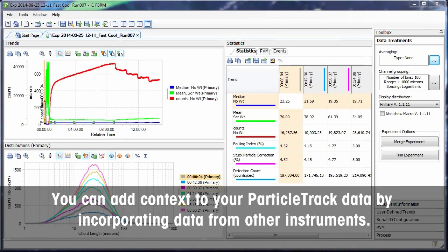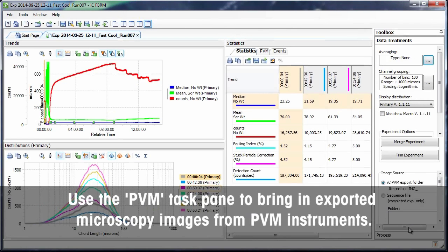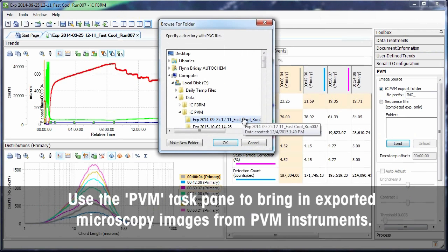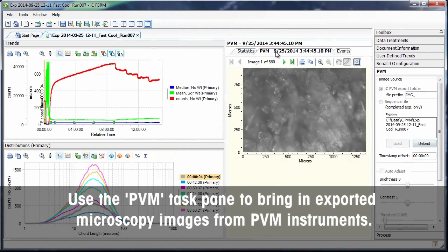You can add context to your particle track data by incorporating data from other instruments. Use the PVM task pane to bring in exported microscopy images from PVM instruments.